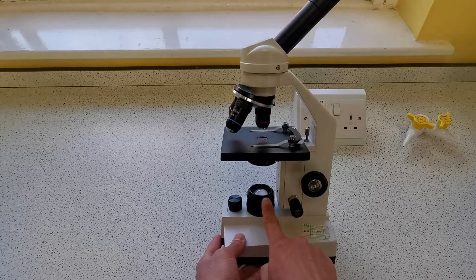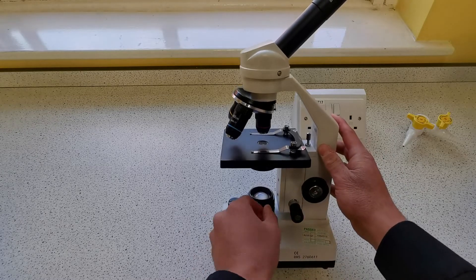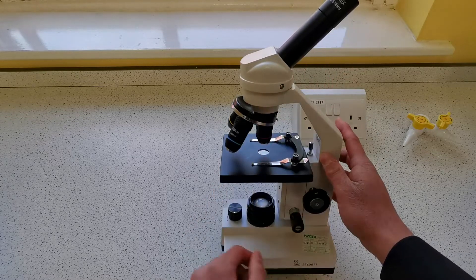Now this is a light microscope. Some microscopes have mirrors here that you can turn to focus the light up through the hole in the stage so that it goes through the specimen and you can observe it.